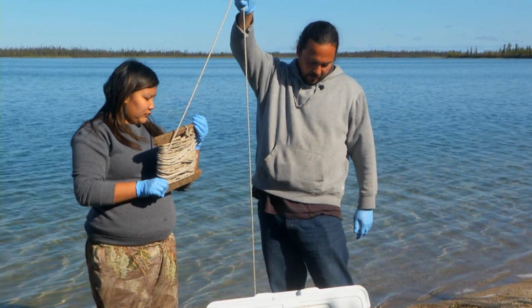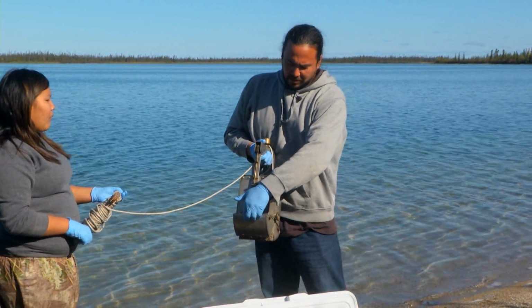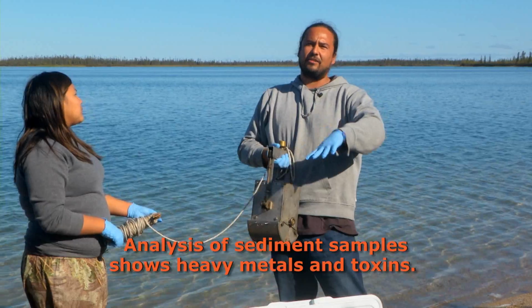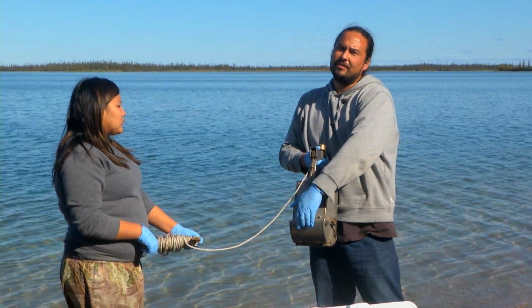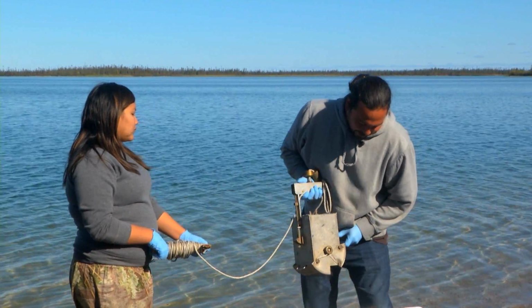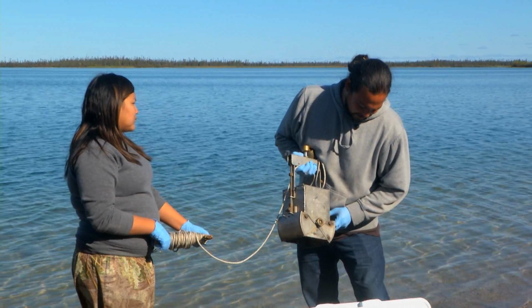And what we want to do with this is to take the sediment off the bottom of the lake. So then when we send this, it'll give us a reading of the heavy metals and any toxins that are settled in the bottom of the lake. And it'll be another way of analyzing water sample and any chemicals in there. We have separate jars for that, but I won't be getting too much into that right now. It's the same process as using the water samples.